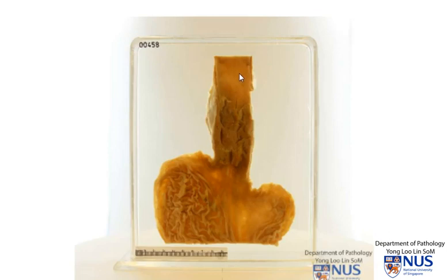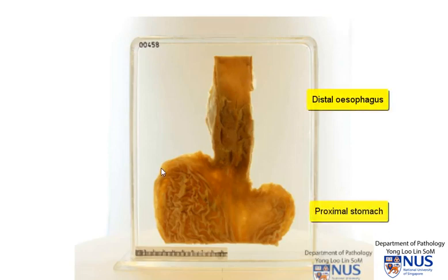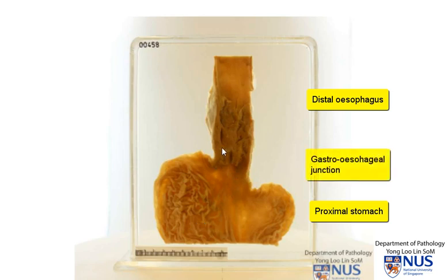This is a specimen of the distal esophagus together with the proximal stomach. Here is the fundus of the stomach and these are the folds or the rugae of the gastric mucosa. This is the gastroesophageal junction and here is the mucosa of the esophagus.